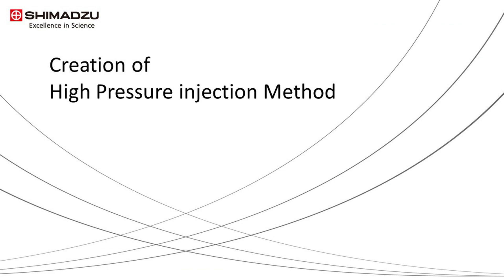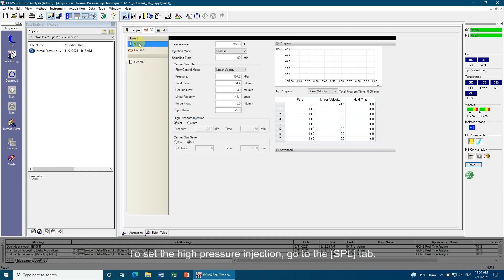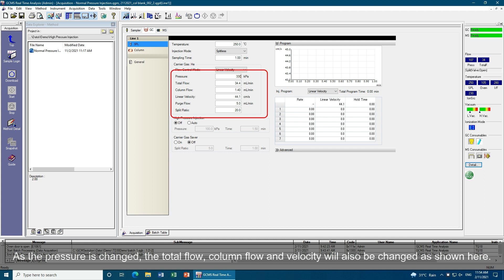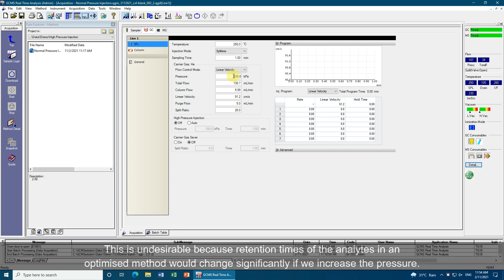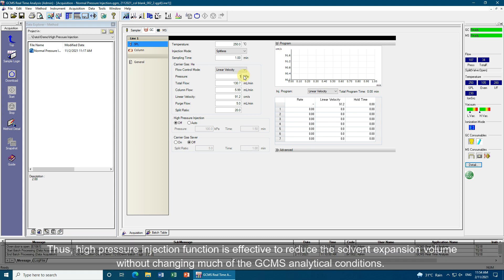Once the head pressure has been determined, proceed to create the high-pressure injection method using the real-time analysis in GC-MS solution. To set the high-pressure injection, go to the SPL tab. As the pressure is changed, the total flow, column flow, and velocity will also change. This is undesirable because retention times of analytes in an optimized method would change significantly if we increase the pressure. Thus, the high-pressure injection function is effective to reduce the solvent expansion volume without changing much of the GC-MS analytical conditions.